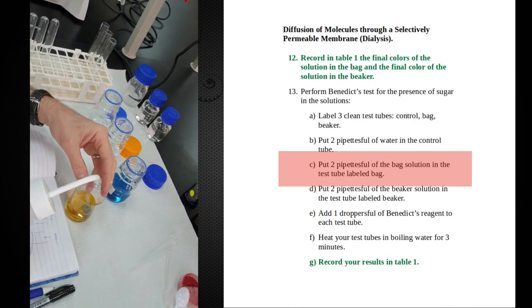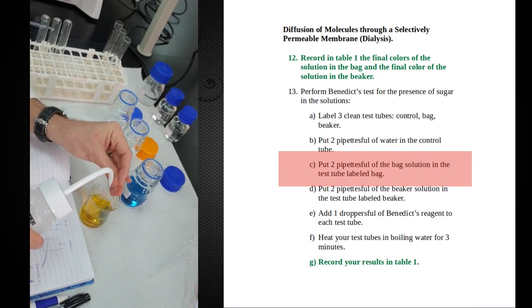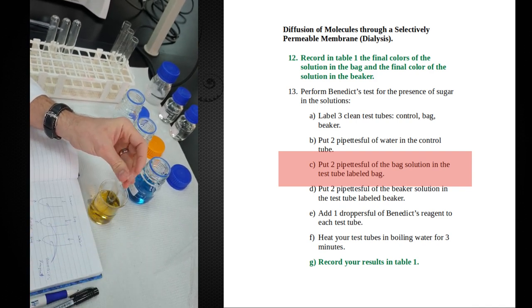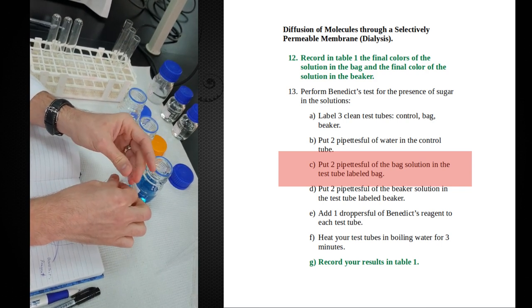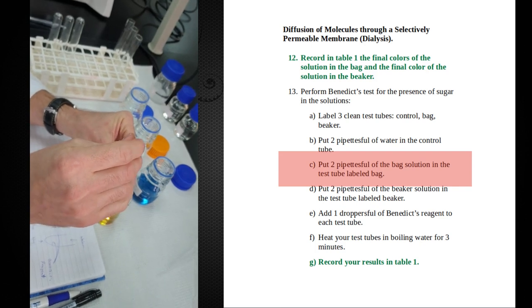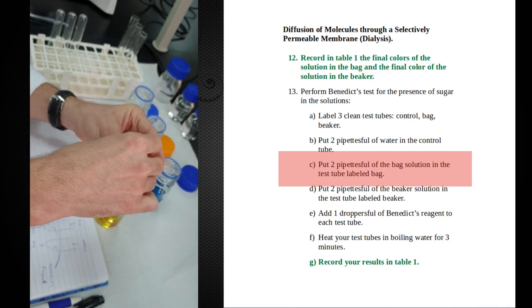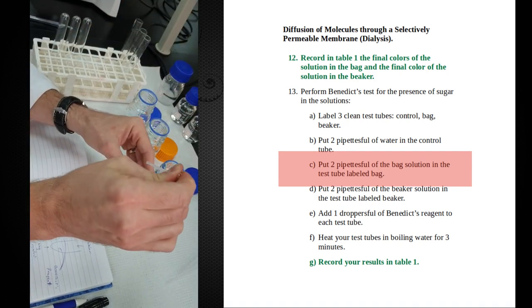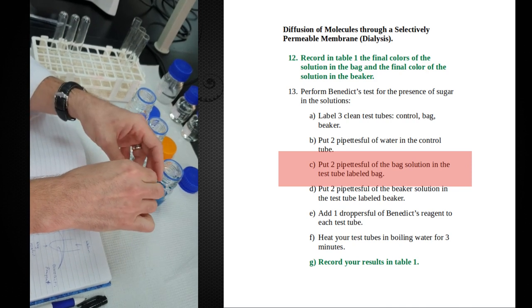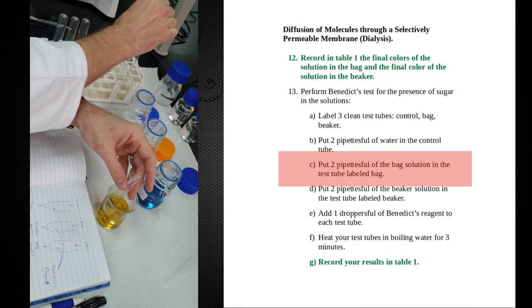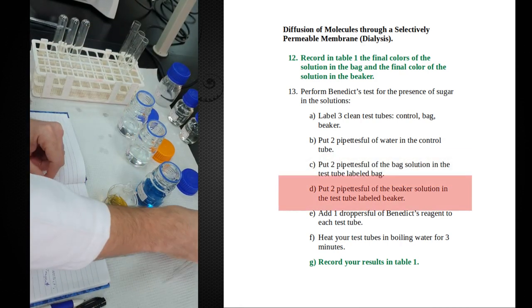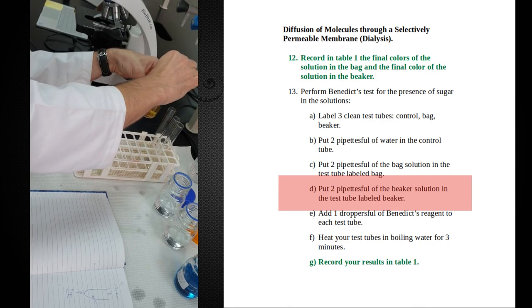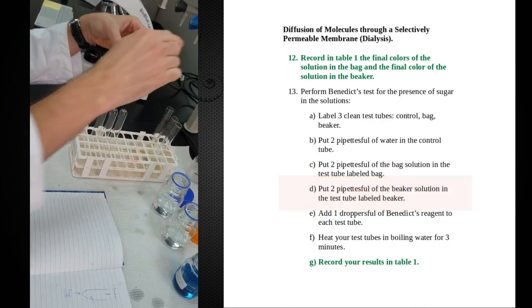I'm just going to wet this bag. When these things dry, they become very difficult to work with. So that's one of the problems. All right. So here we go. We have our tubing released again. I'm going to take a couple of samples from inside the bag. Again, I know I put glucose in there, so that's going to be my positive control. And my experimental would be the inside of the beaker, so I'm going to have two pipetfuls from the beaker.